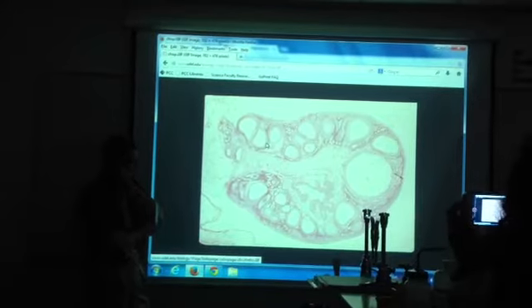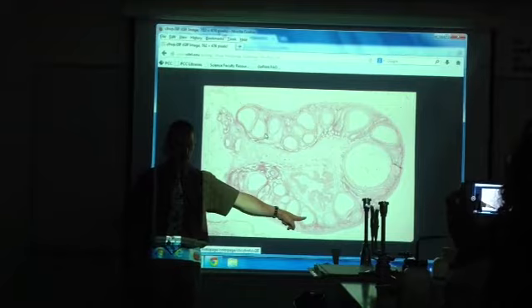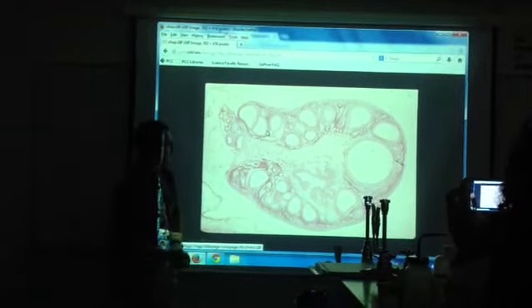Primary. Very good. If I point to this one, give me its follicle. Mature. Give me its oocyte. Secondary. Too easy, drill sergeant.